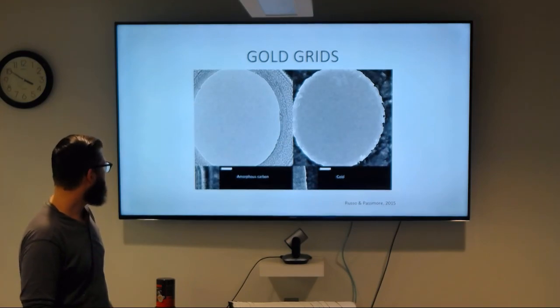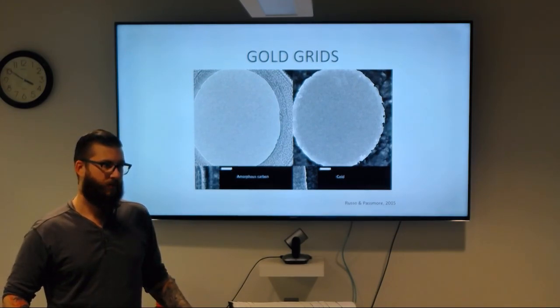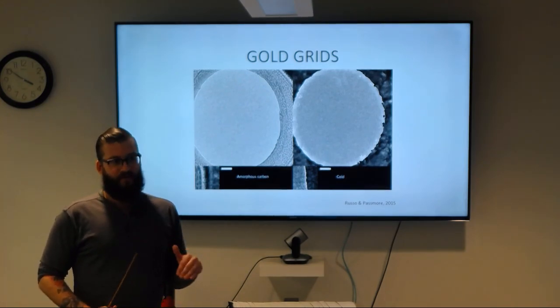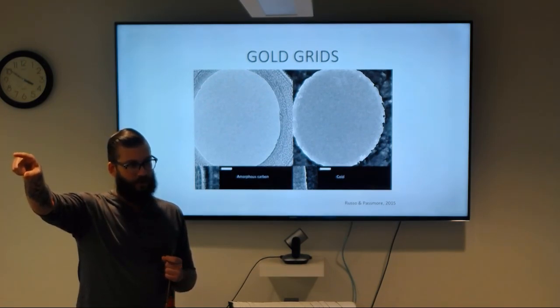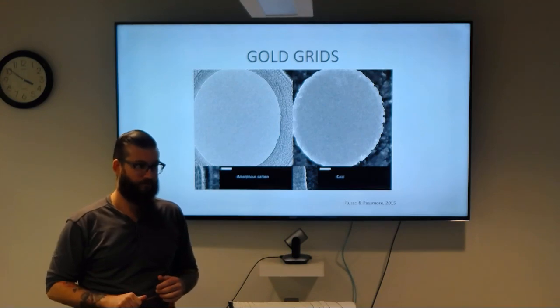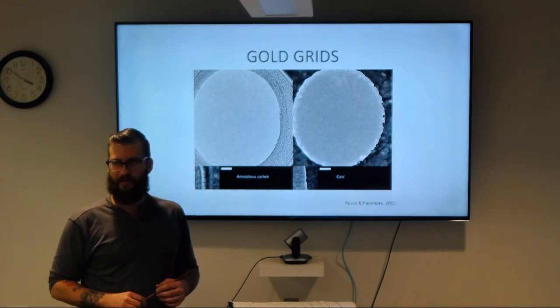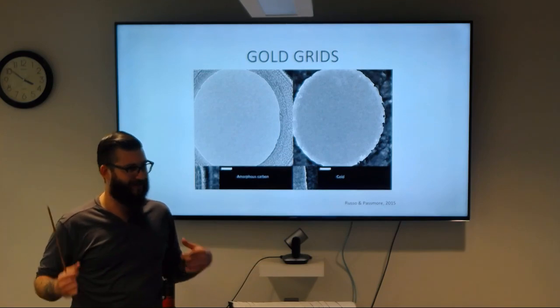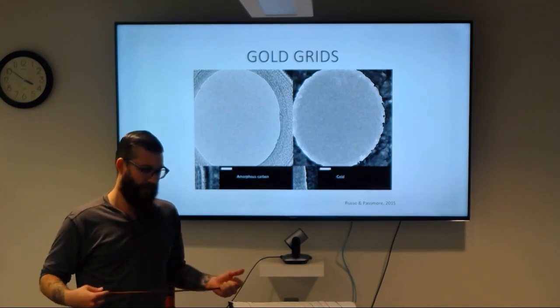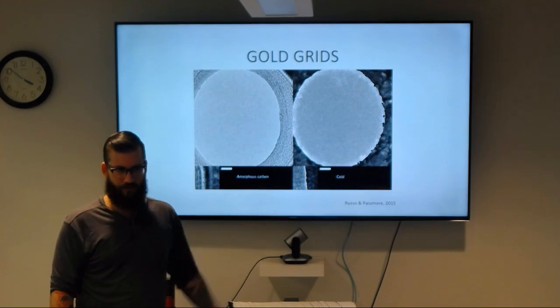For gold evaporation: you take a gold wire, wrap it around a post inside the machine, and the machine heats up and evaporates the gold, sputtering it onto the grids inside. After evaporation you can take it into the plasma cleaner or glow discharger for a few minutes and it blows away all the carbon, leaving just the gold. You can leave the carbon underneath if you wanted to, but we usually remove it. Evaporating gold isn't super cheap, so we don't do it unless making a real batch of gold grids — we make a lot of our own gold grids here.